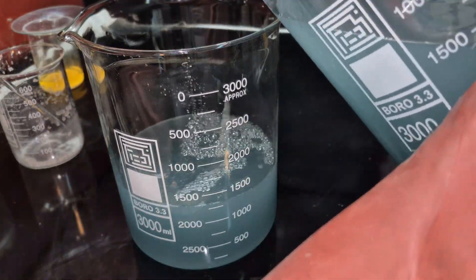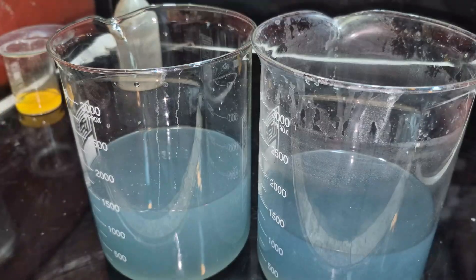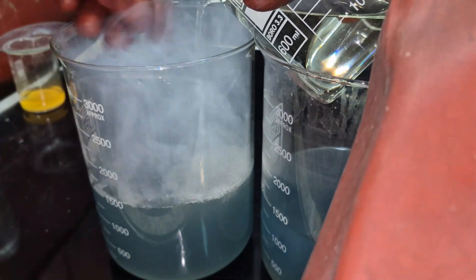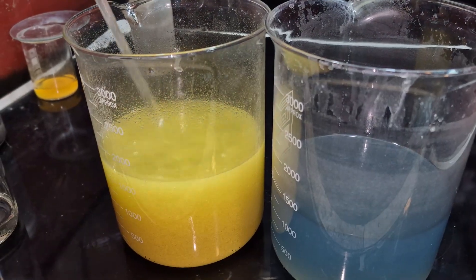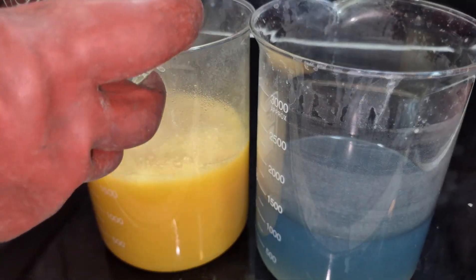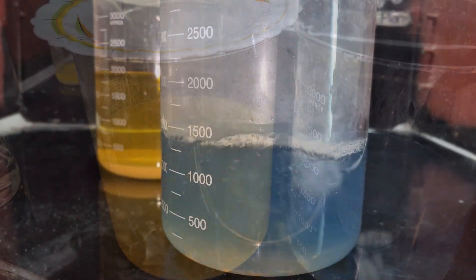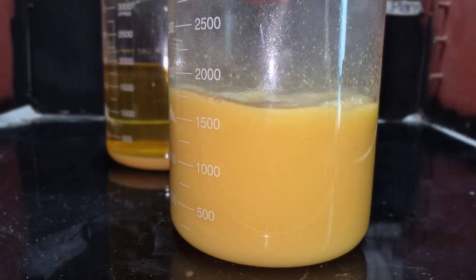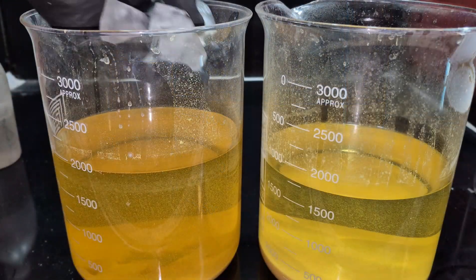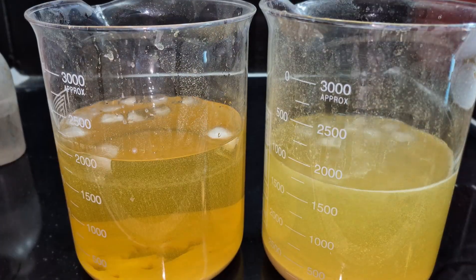I divided the solution between two beakers and then began by adding hydrochloric acid to precipitate the diamine chloride salt. I added a few ice cubes to cool the solution, then proceeded to filter it.